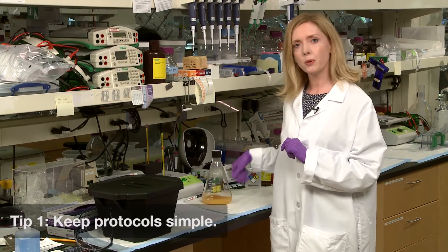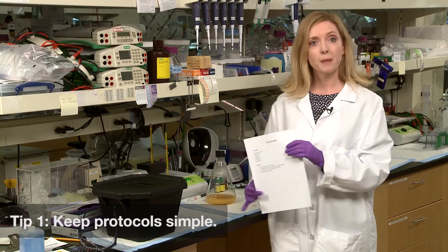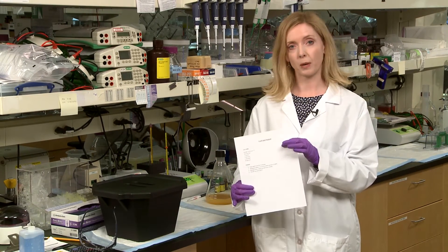Tip number one: keep your protocol as simple as possible. More steps equals more variability between preparations.